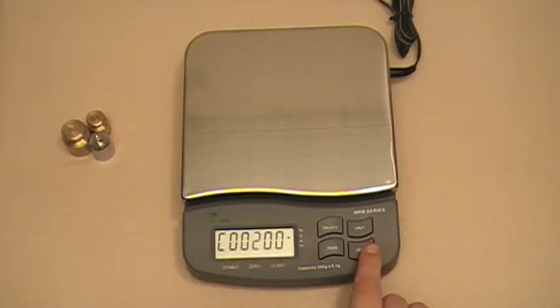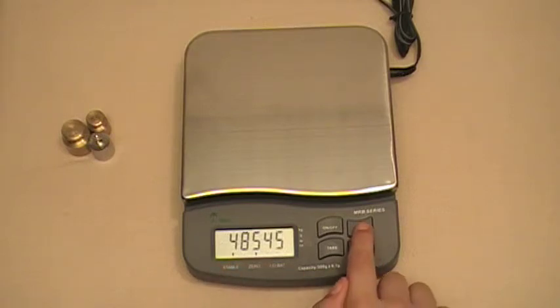Once you're ready to select the weight you're using, press the zero key again. That's going to bring up the AD value menu, which is just a series of random numbers while the scale is calibrating. Now look for the arrow pointing to the stable indicator, and once that arrow is lit up, press the unit key.